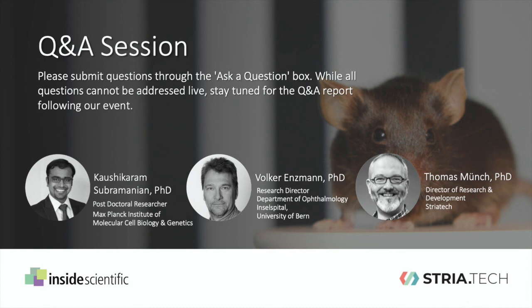That's a very interesting and intriguing question. As one aspect of the advantage that we see for nuclear inversion and the subsequent improvement of vision, it is exclusive for nocturnal mammals, and the small increases in contrast may not be relevant for diurnal animals where there is sufficient amount of light such that the neural circuitry can compensate for any contrast loss.